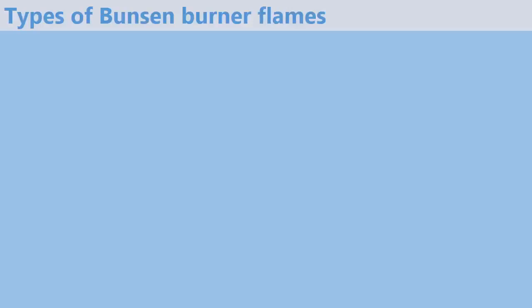Types of bunsen burner flames. Before we talk about the types, what is a flame? In simple terms, a flame is just a mass of burning gases.